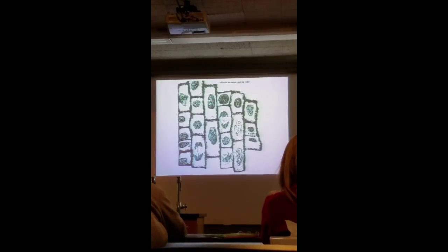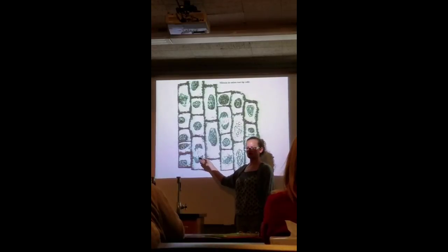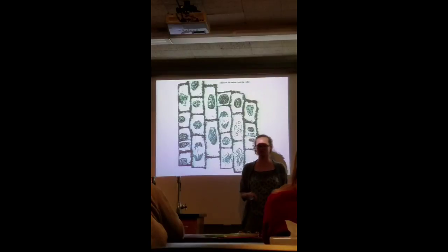How about this one? Anaphase, they're falling apart. What if I said, which phase comes before this one? Metaphase. What if I said, what comes after this one? Telophase, okay, good. So I might ask one of those before or after questions too. All right, how about this one? Metaphase. Okay, this one? Anaphase. What's going on here?